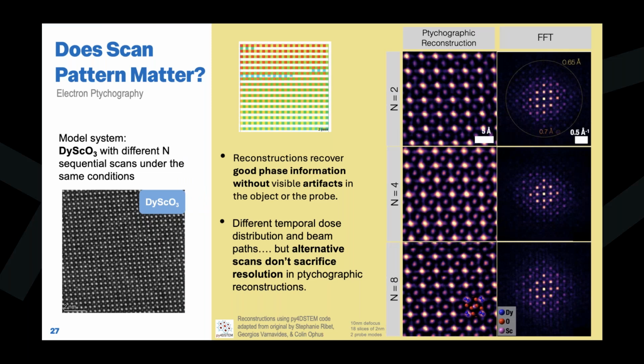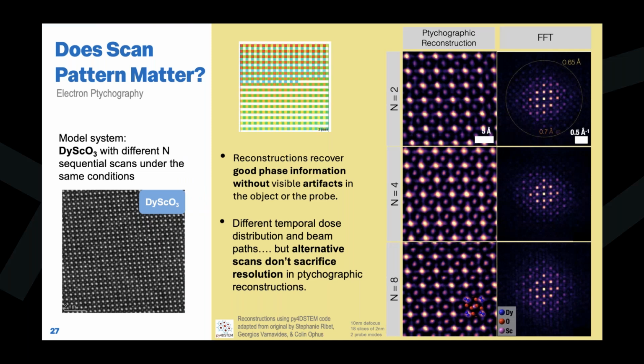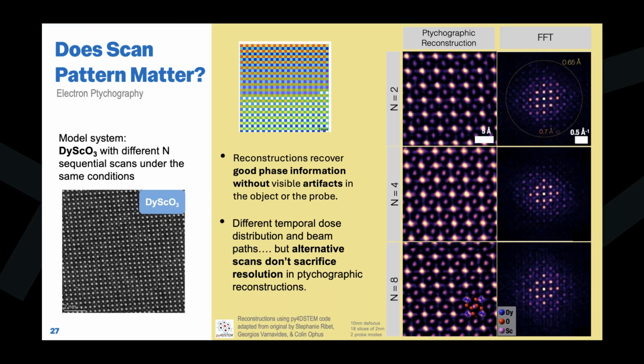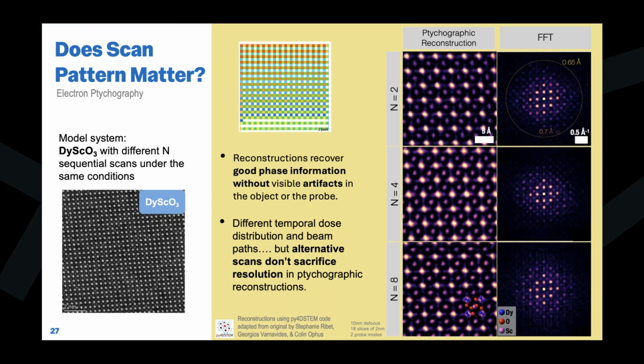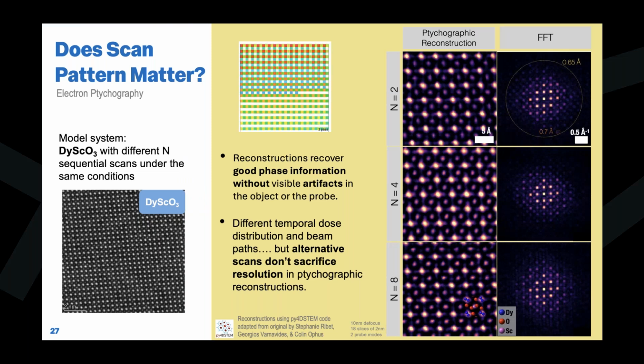And we could see earlier from the ADF and EELS acquisition that the bigger the jumps, the more artifacts you're introducing to your ADF. But in this case, ptychography was really good at still resolving or getting very comparable results for different pixel jumps.